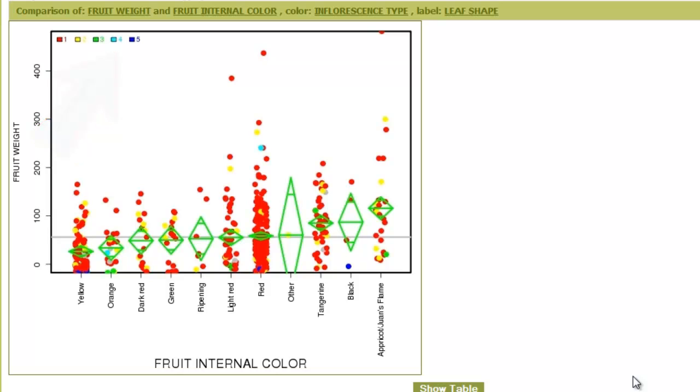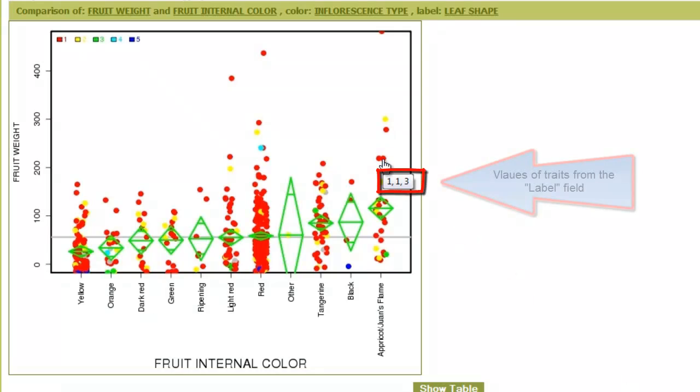Also, we can point the mouse on each data point, like this, and the tool tip shows the values of the traits that we put in the label field.